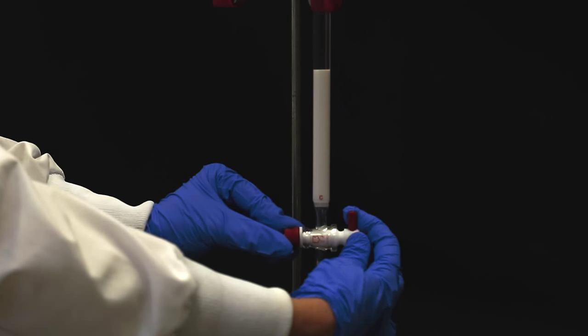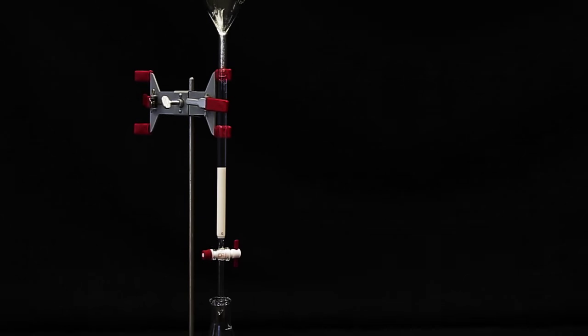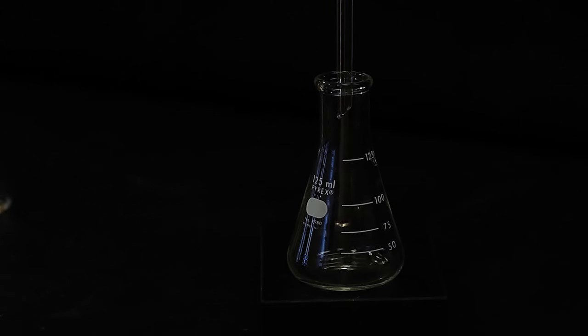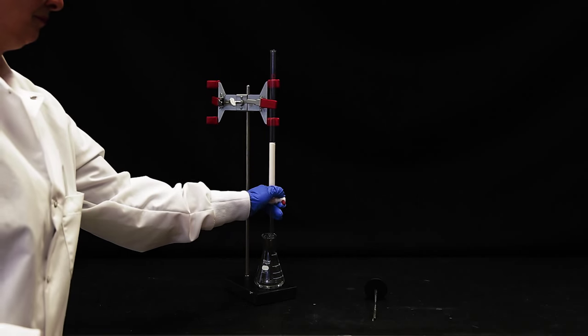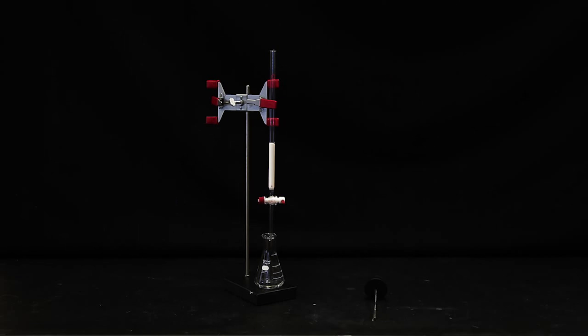Open the stopcock. The excess solvent collects in the Erlenmeyer flask placed beneath the column. When all of the alumina has been transferred to the column, drain the excess hexane until the solvent line reaches the top of the alumina. Close the stopcock on the column. Remove the glass funnel.